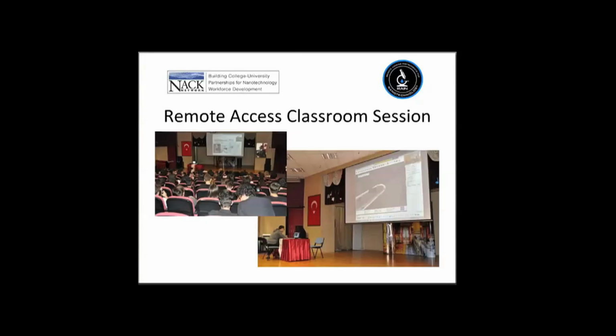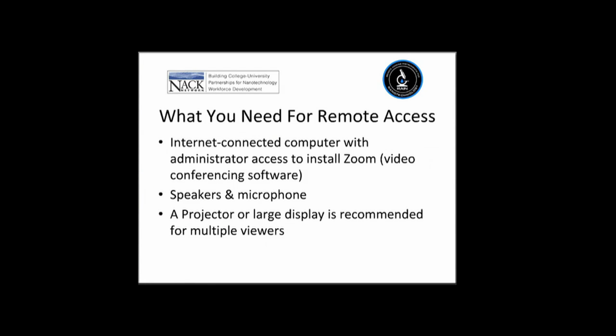All of you teachers know how to use strategies to help engage students during sessions like this one. So what do you need? You're sitting there thinking at your computer tonight, you know, I might be willing to try this. How hard is it going to be? Well, you need an internet-connected computer, no problem, because everyone has that, with administrator access to install Zoom.